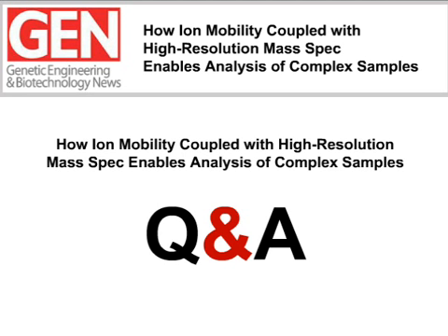Okay, thank you. Well, in the design of this instrument, with any modern hybrid instrumentation, you always want to leave it flexible so you can do both data independent and data dependent experiments, and that's the case here. Through our instrument control and QTOF operation, currently the modes of operation allow both, and we expect that people will find with ion mobility that there'll be applications where you'd like to have both types of experiments available, and that is the case here. Well, very clearly done. Thank you.